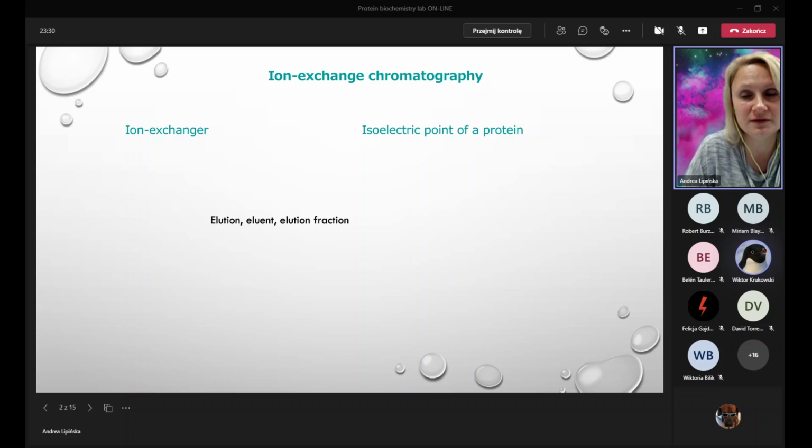Okay. And the first two where the lysozyme was still in the column, the big 50 milliliter ones. Okay. And which fraction had the maximum activity of the lysozyme? Those last 4? Yes. Oh, okay, so that was the reason. Okay. Yeah.